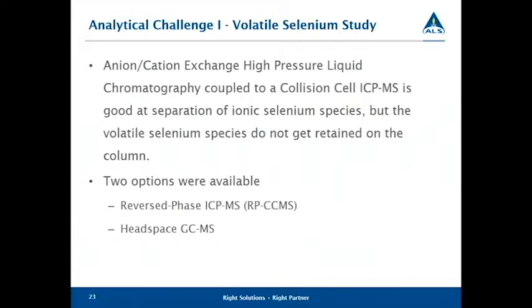And since we had many instruments already in our location in Vancouver that do volatile analysis, we decided to run the samples using Headspace GCMS and to verify that truly volatile selenium compounds were the cause of this. And so we're using just our regular EPA 5021 8260C, or what we call Headspace GCMS method. This just involves heating a water sample with various reagents in a sealed glass vial. We heat to equilibrium, and then the headspace from the vial is transferred into a gas chromatograph, and then the target compound concentrations are measured using mass spectrometry.